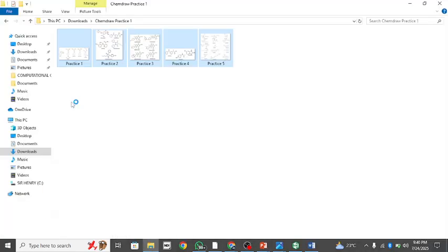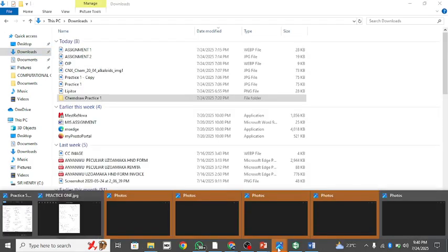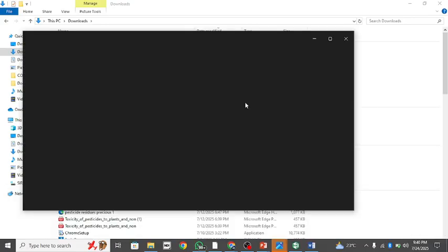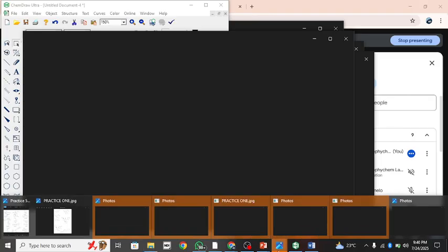Okay, okay. Let me use part of your assignments. I think, what is happening here? Oh, trying to figure out the compound, but I cannot find it. Trying to figure out the structure, but I can't find the structure.